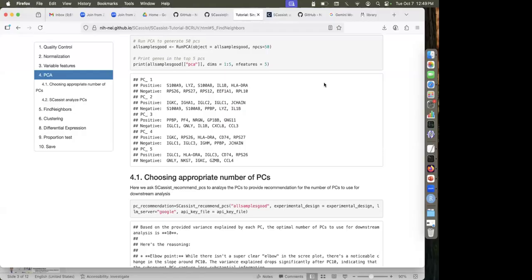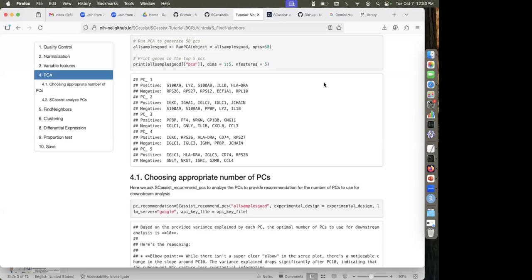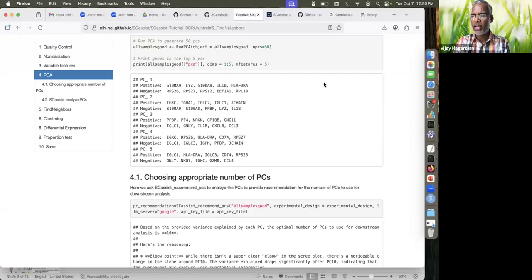Yeah. So are you asking if we can train the model Llama 3 with the single cell data? Yeah, because the SCassist tool can give correct or good answers about biology problems. I think the post-train is important for the tool. So I want to know whether you have done the post-train. Yeah. So you mean post-train is what you mean? Are you talking about fine-tuning?